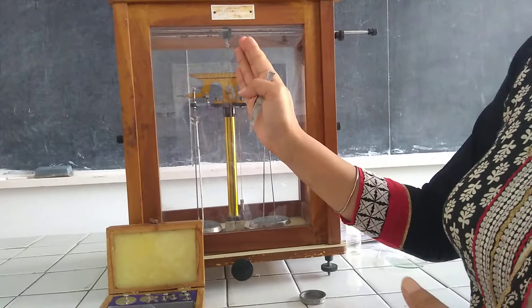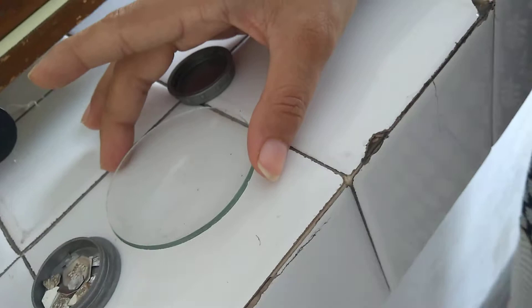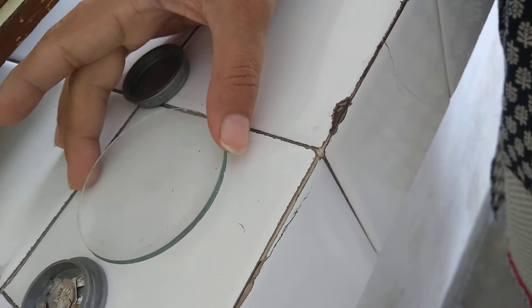This is a watch glass, which is placed on the left-hand side pan to weigh our sample. Since some chemicals are corrosive in nature, we cannot place them directly on the pan. This is the weighing bottle, which is also used for weighing purposes.